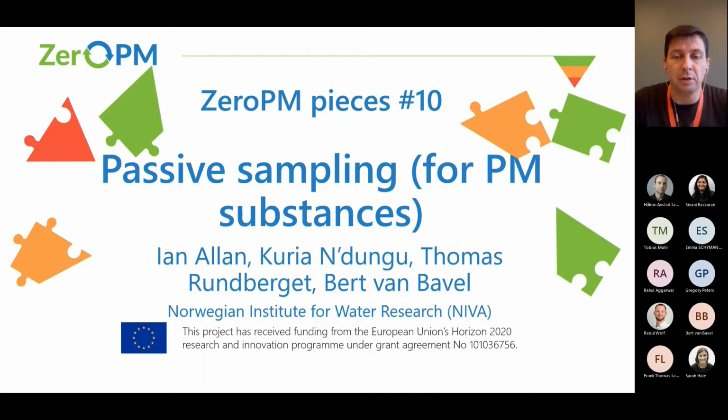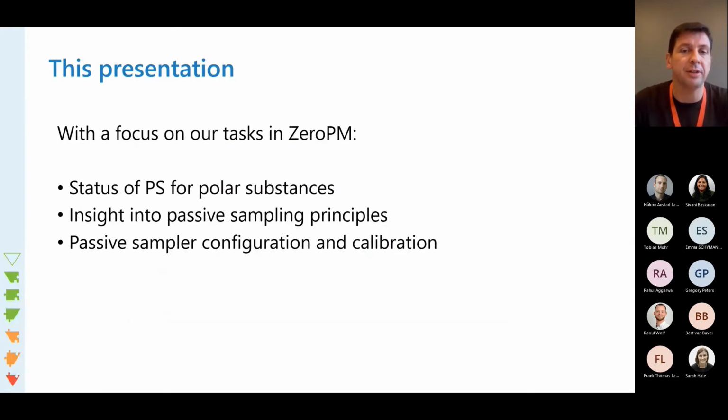I turn this week to talk about passive sampling, and then actually we're going to focus really on PM substances and the passive sampling of PM substances. So this presentation is going to present a status of passive sampling for polar substances, an insight into the principles behind passive sampling, and then a little bit on what kind of passive sampler configuration and calibration can we do for these substances.